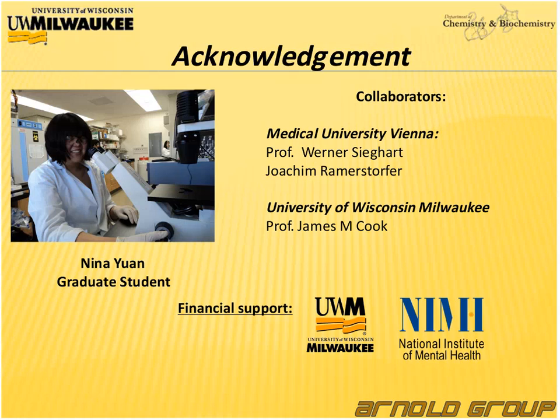Okay, there's one question here about the resistance. Yeah, the resistance is calculated for all the 20 cells in total, and in general, we are not really reaching the giga-ohm seal here. But what we actually figured out by monitoring the different resistances is that the absolute value we are getting for each ensemble doesn't really have anything to do with the performance of the assay. So there is no correlation between higher resistance and better data. There is no relationship between these two parameters.